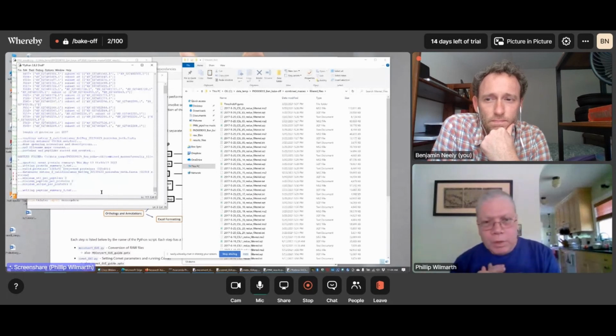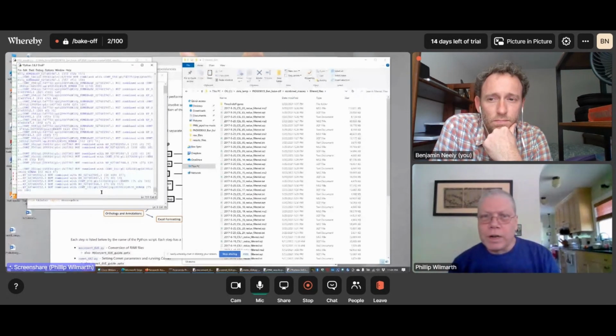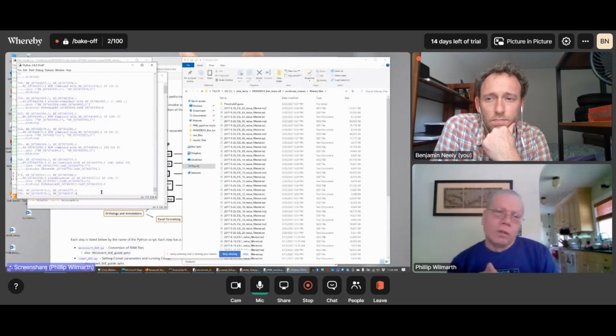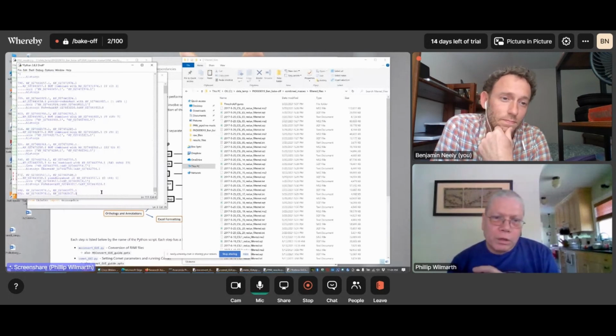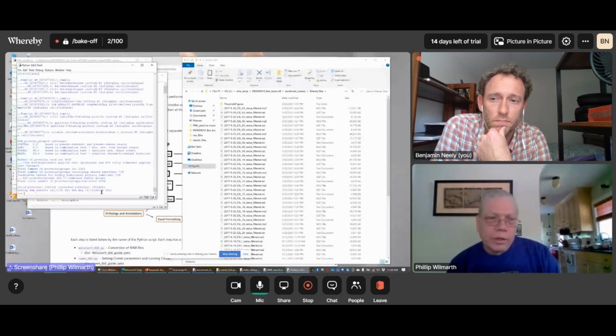And the pipeline uses a 2 peptide per protein rule, which is, it doesn't do any sort of protein ranking function and try to do any protein FDR analysis. It's just based on whatever peptides you pass through from your filtered file. It just maps them, does the parsimony analysis, and then requires 2 peptides per protein per sample. That usually provides pretty good error control and results in a pretty low overall protein FDR. So we had 9 decoy proteins out of 2,365 total proteins.